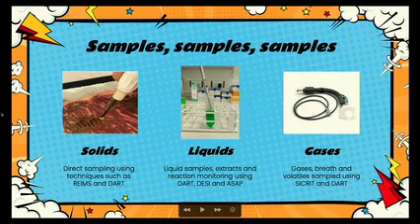DART as well, there's some 45-degree ablation attachments for the DART source, so you can put a piece of tissue or a sample, something like a pharmaceutical tablet if you're interested in an unknown pharmaceutical product. You can get the DART source to sit at a 45-degree angle. The plasma ablates over the surface of the specimen and is then taken into the instrument. DART sources tend to have a small little additional vacuum pump, a little diaphragm pump, but again, it's an inexpensive thing compared with a standard sort of roughing pump that you would find on a mass spectrometer.